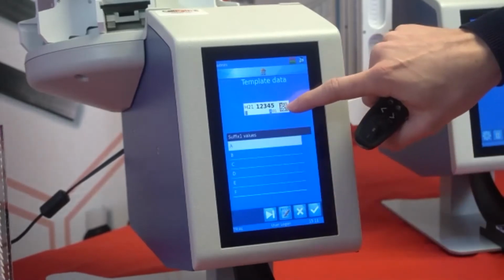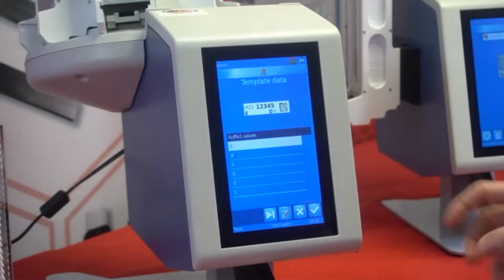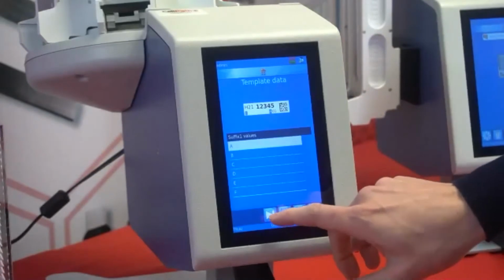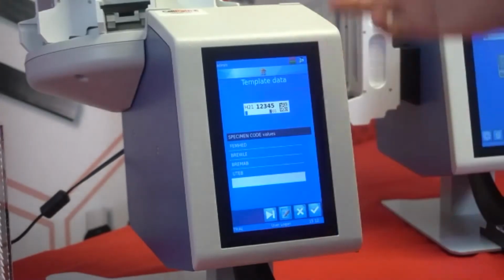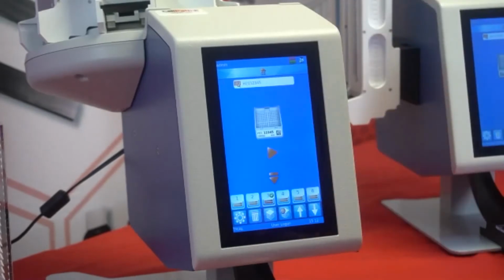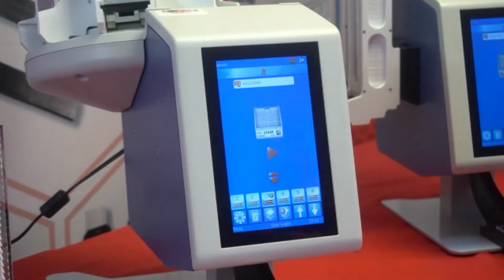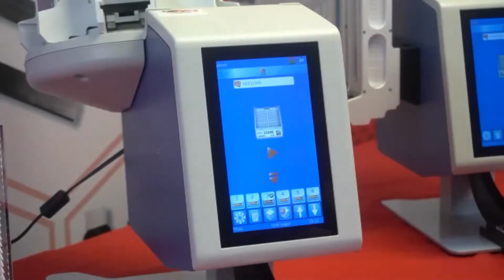We've got 01 next to that, which is an automatic incrementer that I've set up, so we don't need to enter the block number manually. And if we move across, we've got the specimen codes, just as an example for today. If I hit tick on that, we're now in a position where we can print. And as you can see, the barcode here changed shape, which will contain all of the information that we have just discussed.